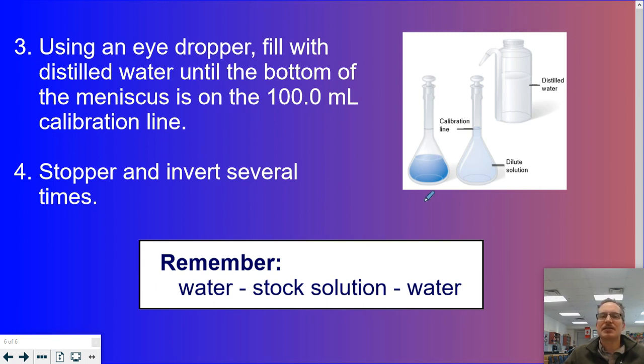Last but not least, if I need to, I will tap out any bubbles. I'm going to put the cap on, invert it several times, and let the natural air bubble mix my solution.